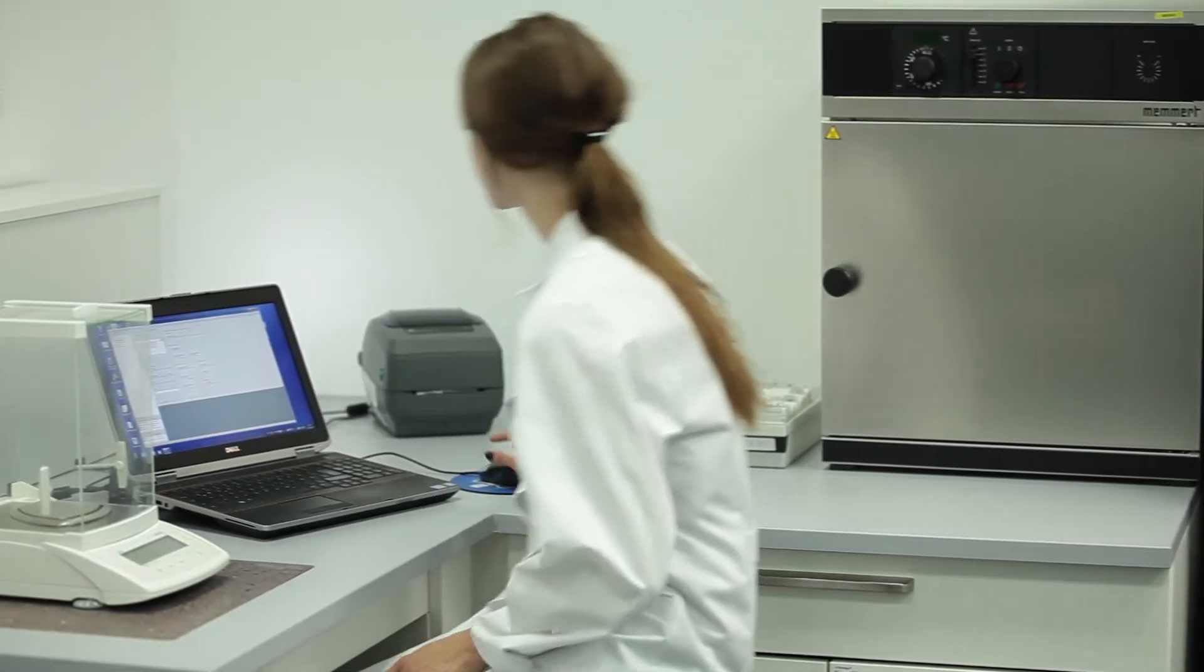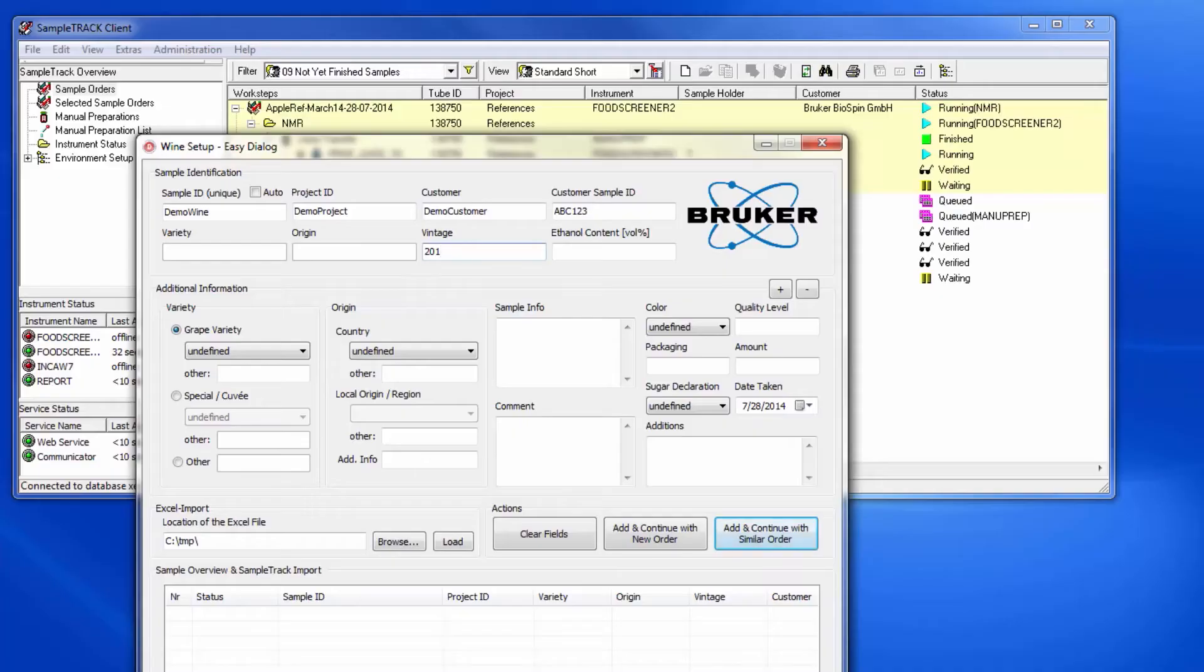A straightforward user interface facilitates easy barcoding and bookkeeping, also allowing Excel sheet input.